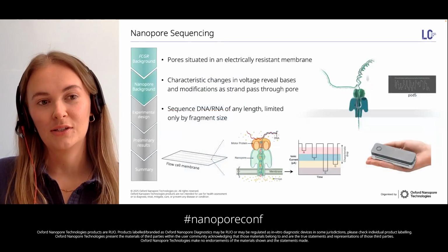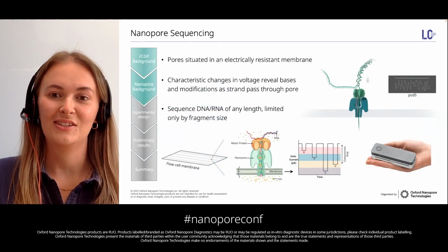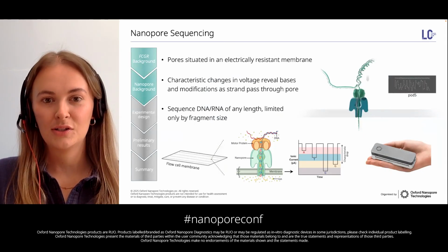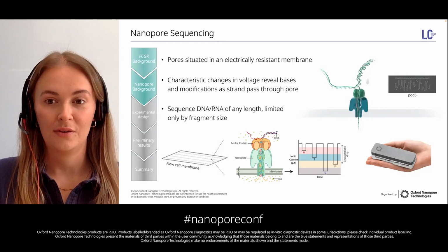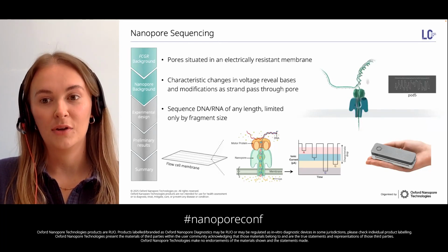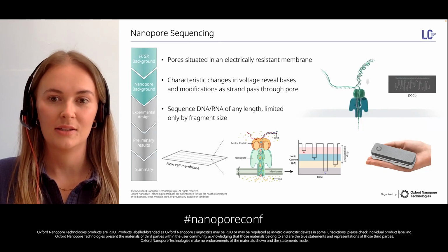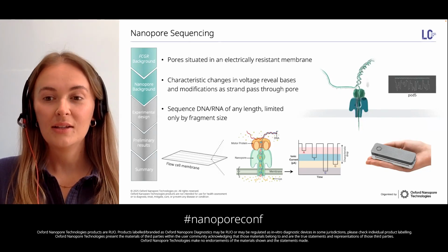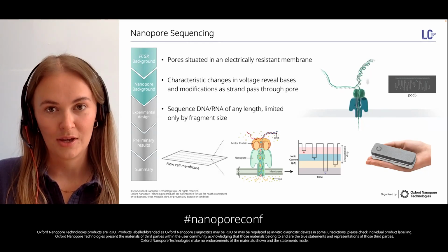So our solution is to use Oxford Nanopore sequencing, and I'm assuming this audience is already pretty well versed in the tech, so I won't be going into that too much, but I will say the flexibility of this platform is a huge benefit, and our key motivation for choosing this is its capacity for generating those ultra long reads, increasing the chances of spanning our tricky region. Plus, since it sequences the native DNA directly, you can also pick up on those base modifications too, as a little bonus.